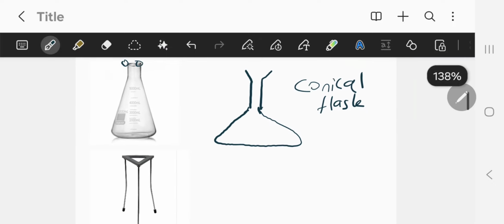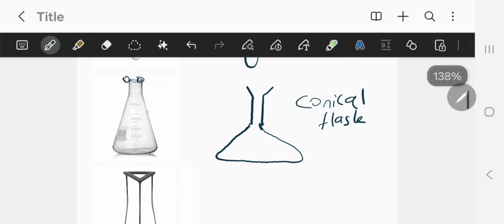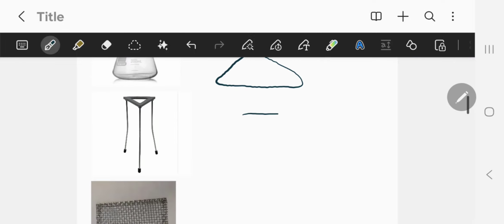So all of these images I'm drawing now, there's pictures. These are all looking side on, okay? It's not a bird's eye view looking from above. It's looking from the side, like that. Now with tripods, you've got a flat line there because if you were to rotate it this way, it'll look flat, yeah, this bit here. And one of the legs will be hiding behind the other one of the other legs too.